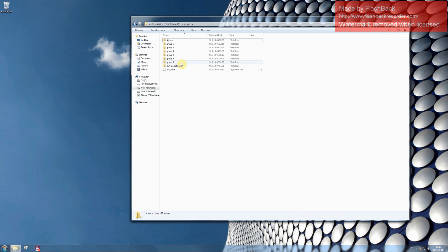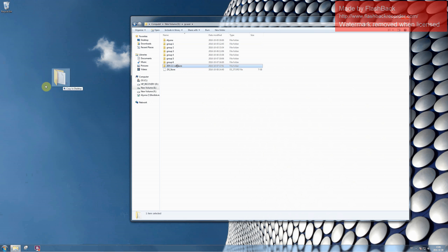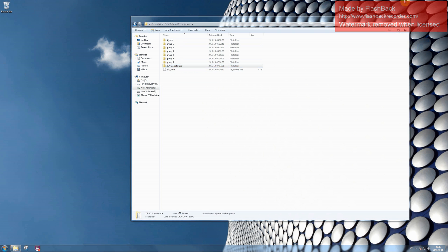When you open your folder on the graphics server, you will see among your data a folder called Zen software version 2.1 or 2012. Please copy this folder to your computer.